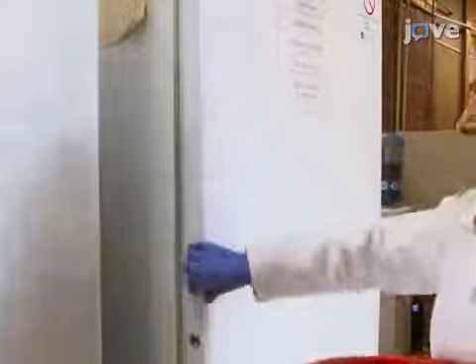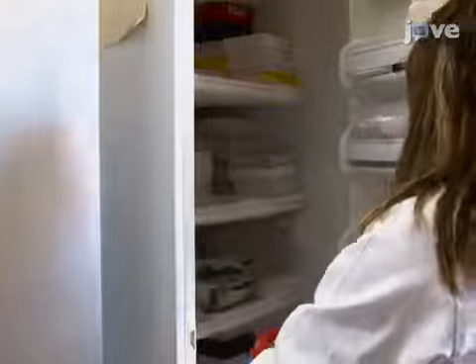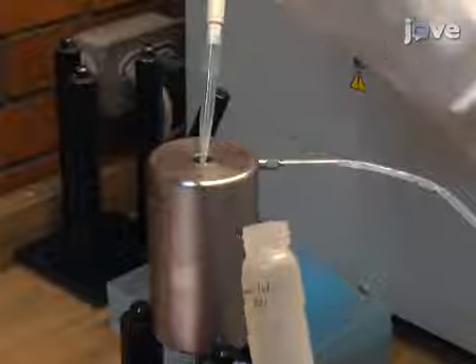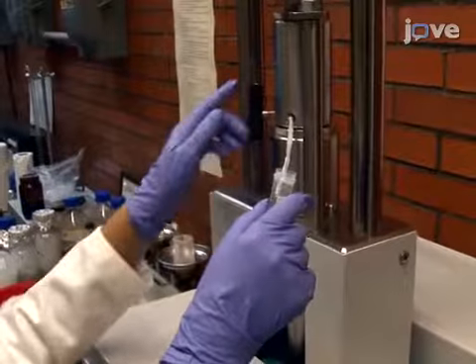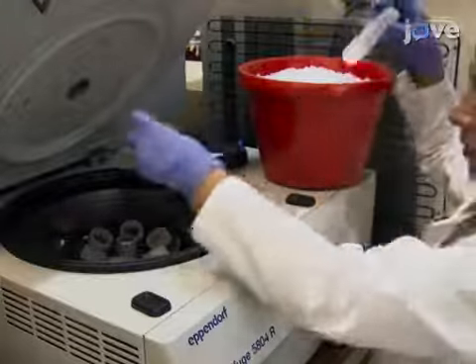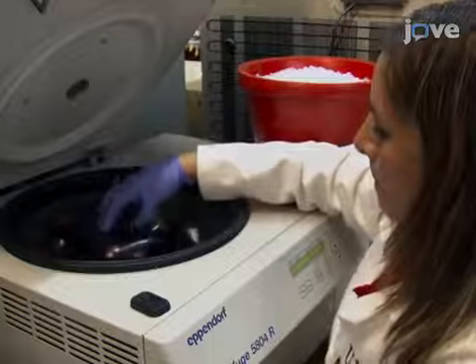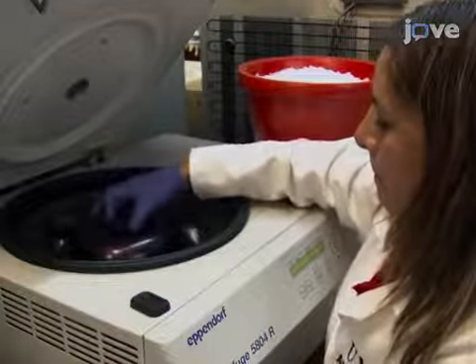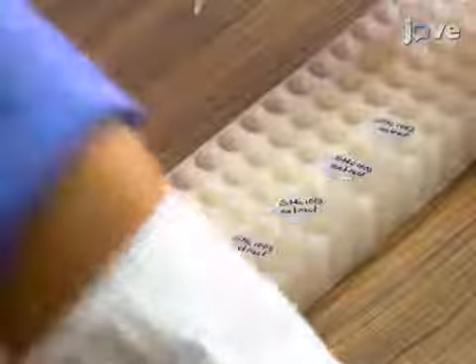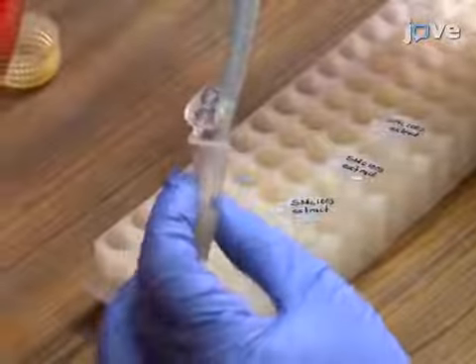To prepare cell-free protein extracts, defrost bacterial cell suspensions and store them on ice. Then, pass the cell suspensions 3 times through a cold pressure cell at 20,000 pounds per square inch. Remove the intact cells and cell debris by centrifugation at 5,000 times G for 30 minutes at 4 degrees Celsius. After centrifugation, prepare aliquots of 100 and 500 microliters from the supernatant for subsequent analysis.